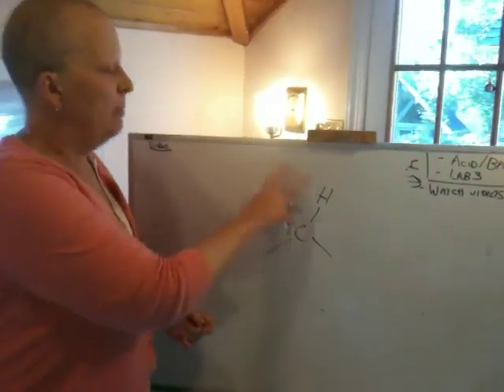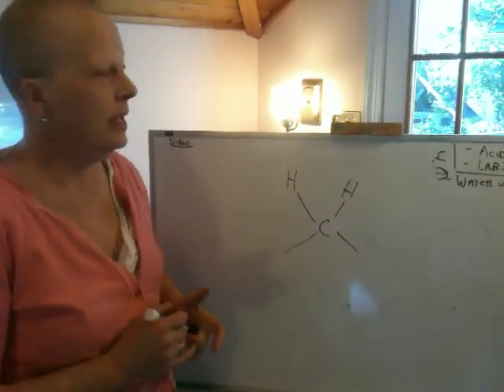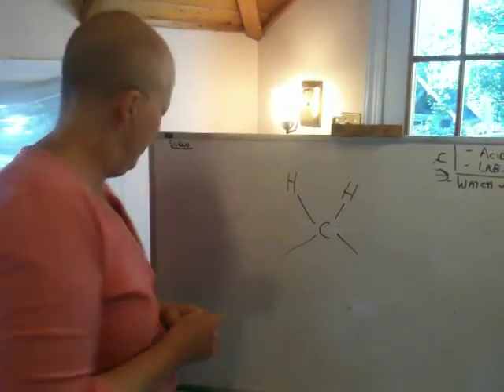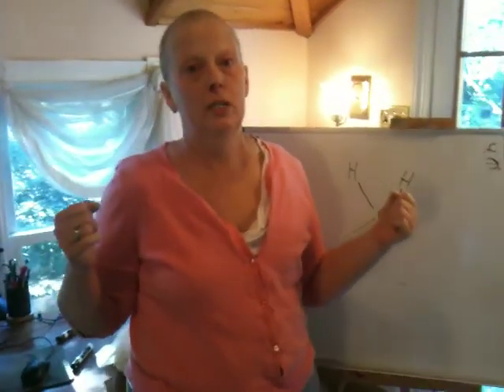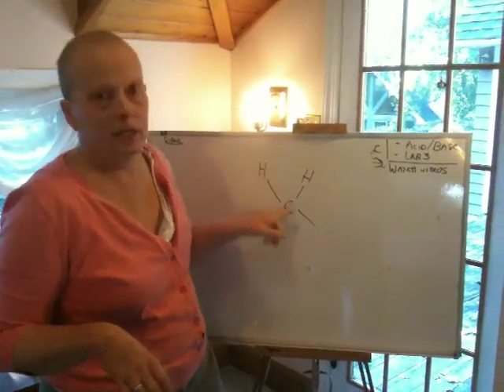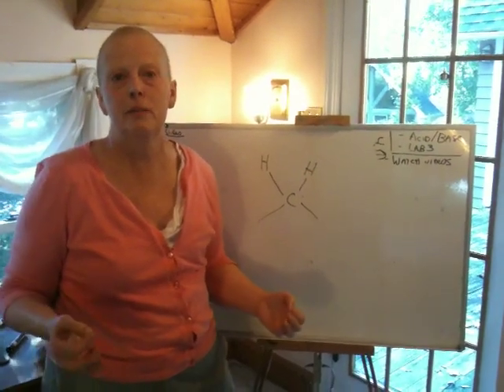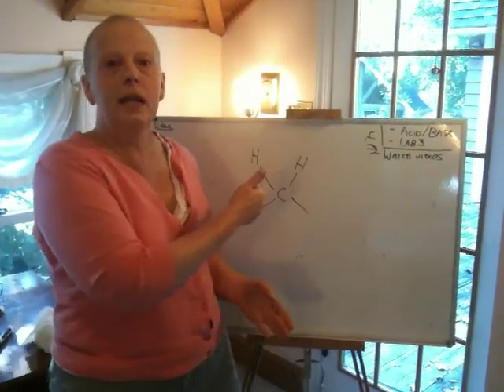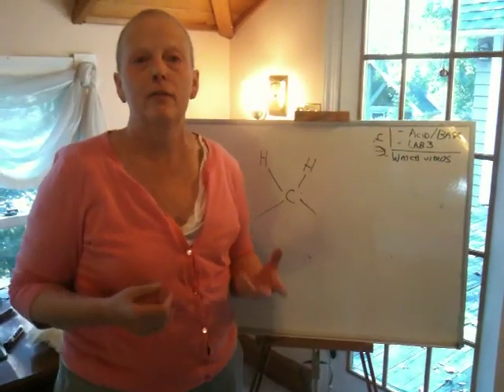These bonds will vibrate together in concert, and they have different kinds of vibrations. I always tell students this is a great time to get some good upper body exercise. These CH bonds absorb around 2,900 reciprocal centimeters. So when I put in 2,900 reciprocal centimeters, those bonds will absorb the energy, and they'll give a peak.